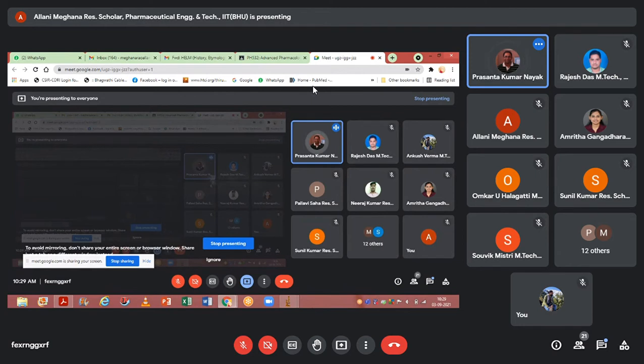When you are processing the live sections, fixing them and putting antibodies, there may be some artifacts which may be darker than CA1. So if you consider the first one, the saline images, as your normal one, then you keep that highest threshold as it is, so that artifacts can be minimized.